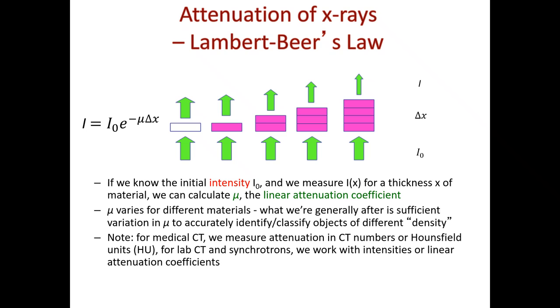Okay, so it's a certain range of numbers, and again, it's very hard to get a very specific reference to what material you're actually seeing based on the number you see. They're scaled, reconstructed. They technically lose the meaning except for this relative value between two neighboring numbers, okay? Relative difference. And attenuation is essentially 1 over intensity. So attenuation measures how much I have weakened by going through the material.